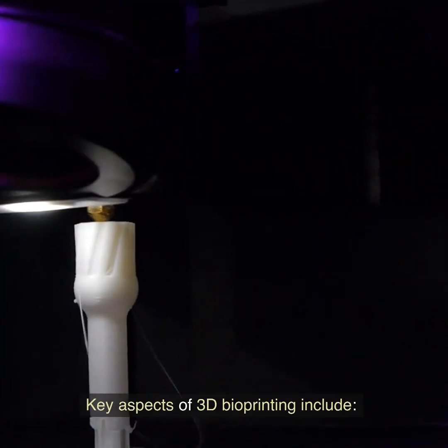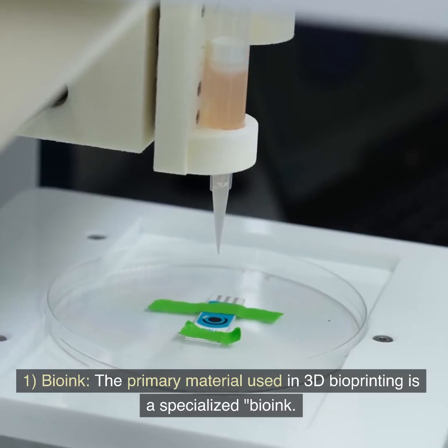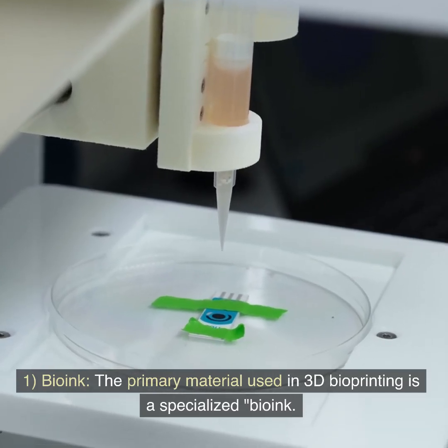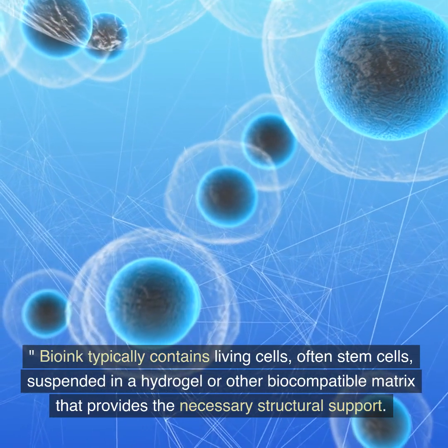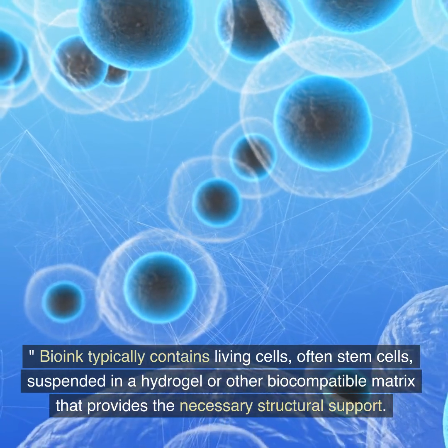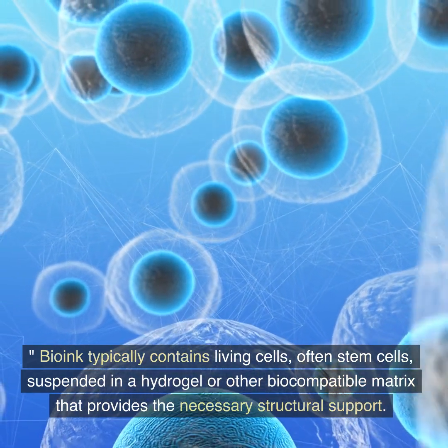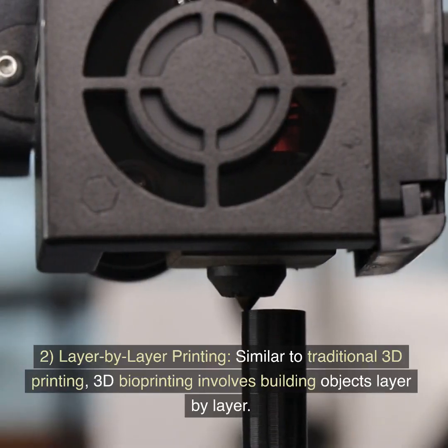Key aspects of 3D bioprinting include: 1. Bioink. The primary material used in 3D bioprinting is a specialized bioink. Bioink typically contains living cells, often stem cells, suspended in a hydrogel or other biocompatible matrix that provides the necessary structural support. 2. Layer-by-layer printing.